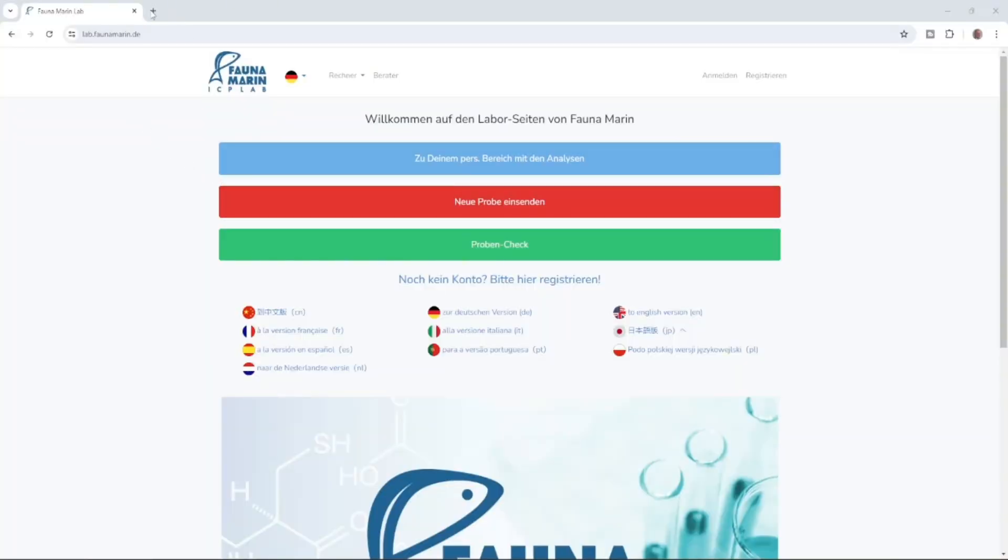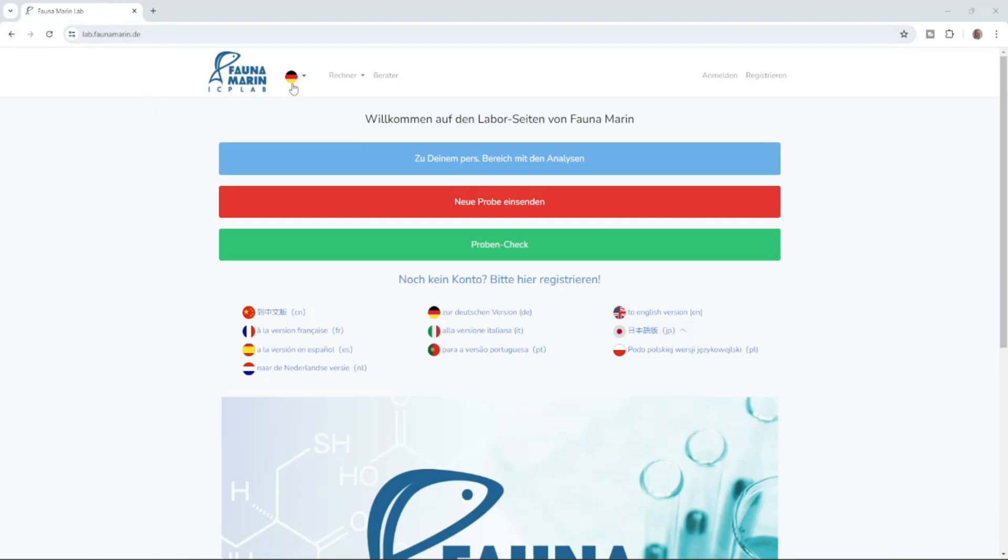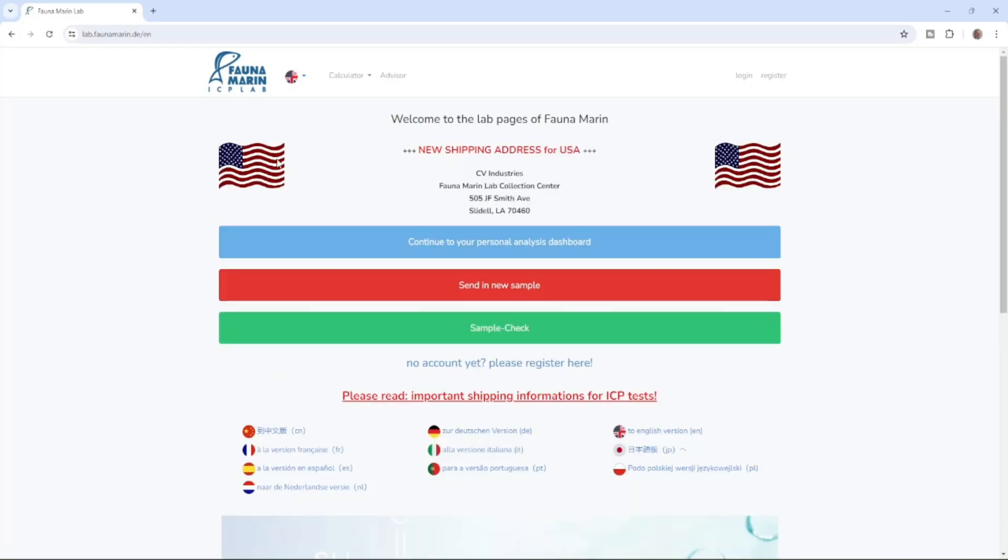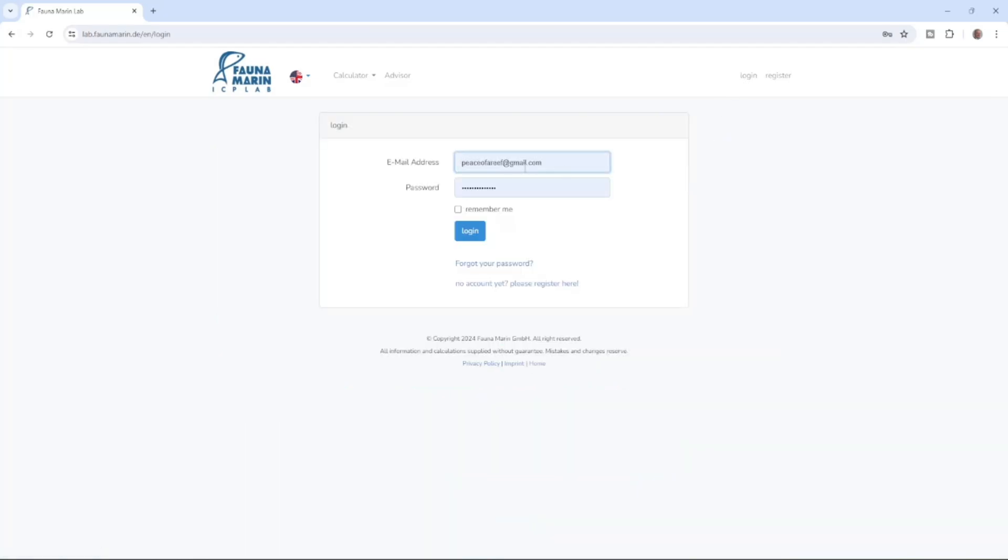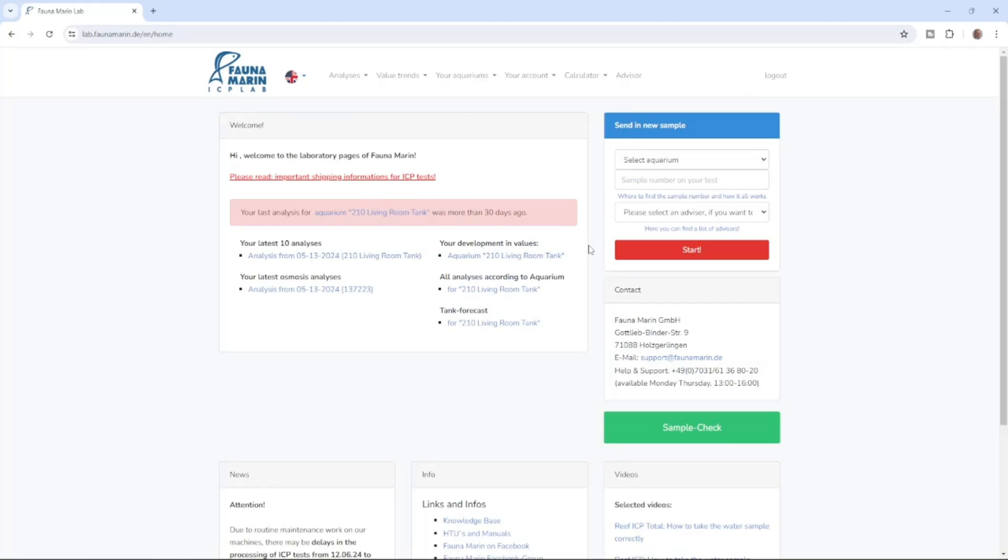Once on the computer you're going to want to navigate over here to lab.faunamarin.de and then you'll change this to the language that you're going to speak and let that load. If you're brand new to this site you're going to have to register but I've already done that so I don't have to go through that. It's showing me right here that CV industries, that's coral view, is a lab collection center. Let's go ahead and get logged in here. All right now we are logged in.